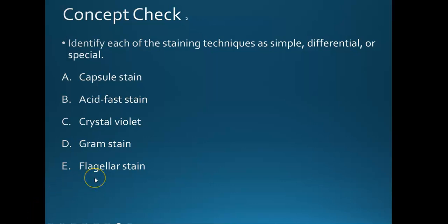And a flagellar stain is a special stain that is used to make the flagella a lot thicker so they're easier to view under the microscope.